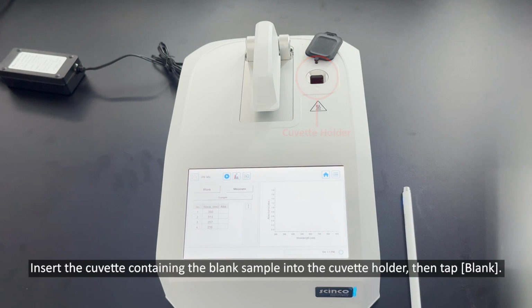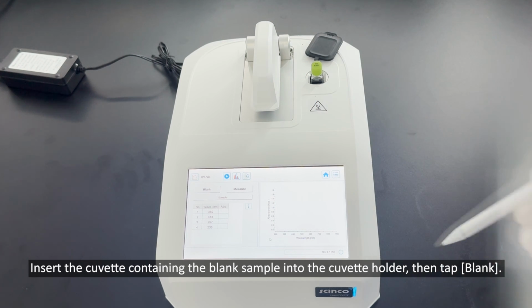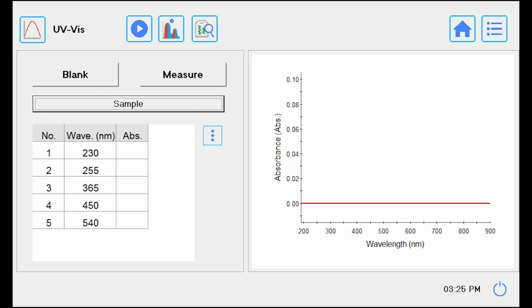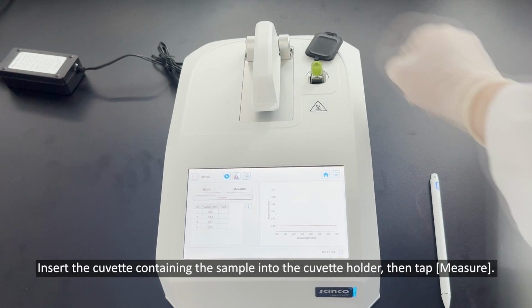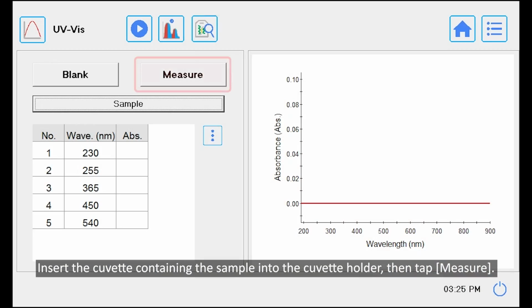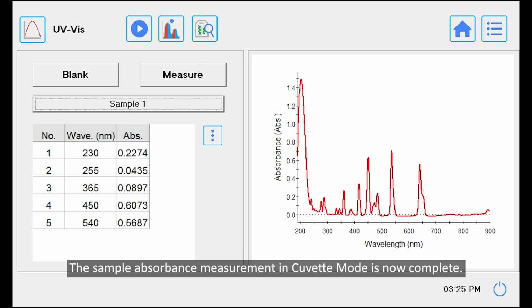Insert the cuvette containing the blank sample into the cuvette holder, then tap blank. The blank measurement in cuvette mode is now complete. Insert the cuvette containing the sample into the cuvette holder, then tap measure. The sample absorbance measurement in Cuvette mode is now complete.